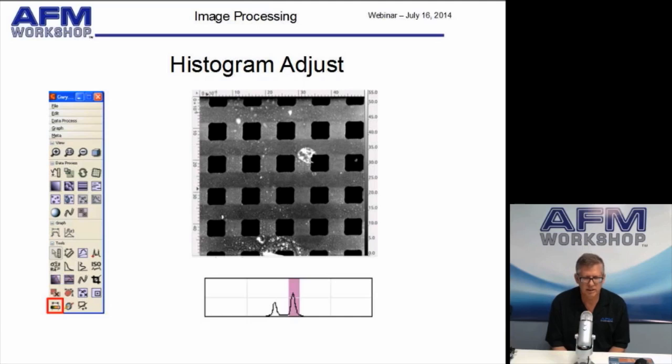Okay, the next question is inversed image line by line nanoparticles. I don't quite understand that question. Is it inversed? I don't think it's inversed.